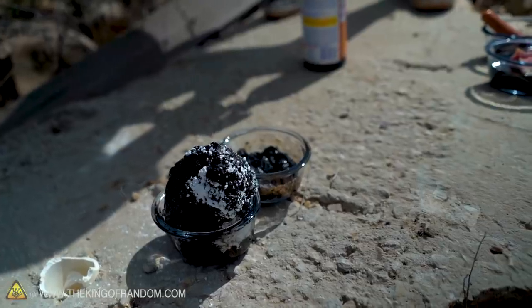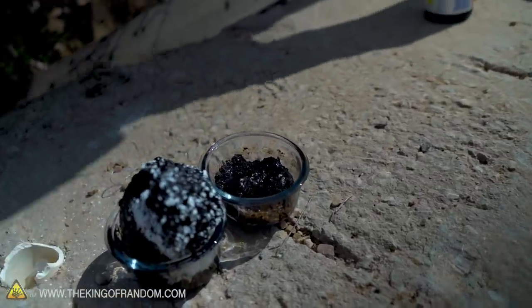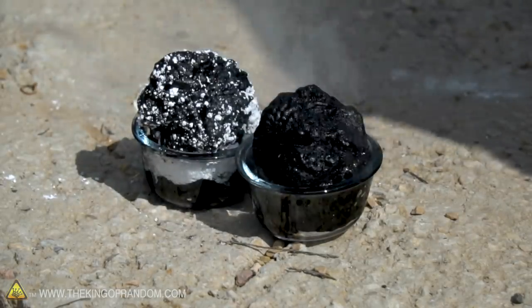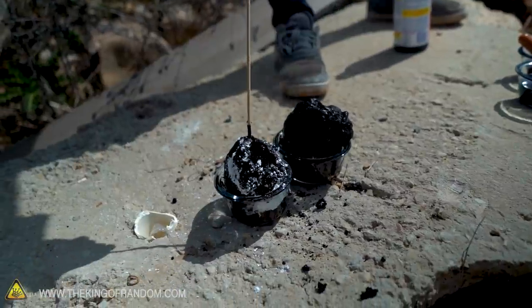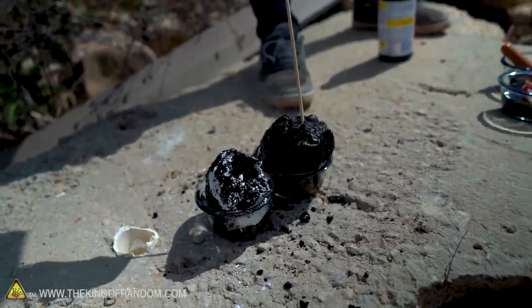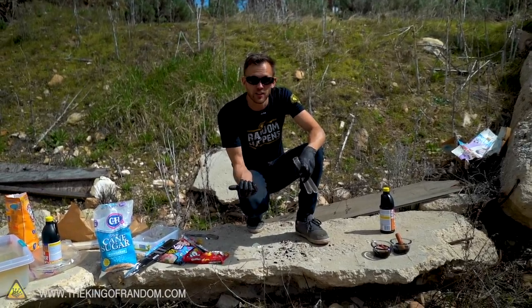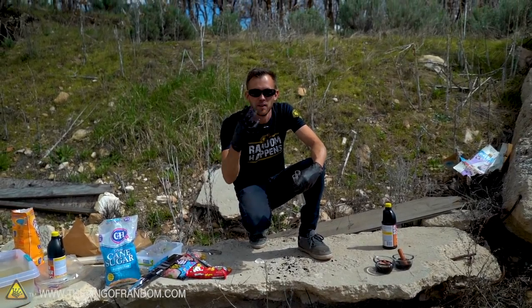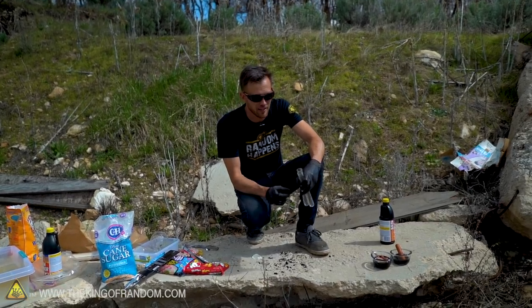We're now starting to see the reaction in the granulated sugar too — it just didn't happen as fast. The powdered sugar foam is a lot lighter, while the granulated sugar is more dense. They're both kind of a foam, just different densities noticeably. I've seen sulfuric acid mixed with granulated sugar before and it does react and bubble up, but with the powdered sugar it goes way faster, and I think that's pretty cool.